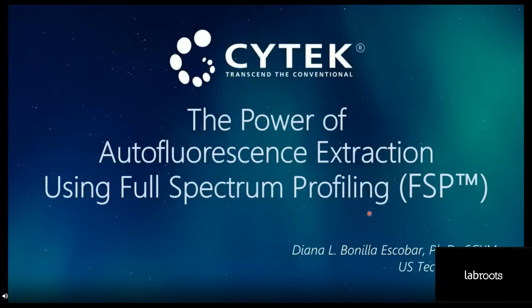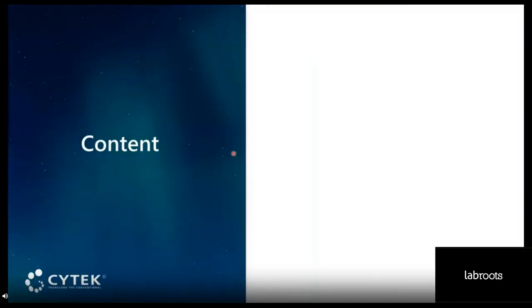Morning, everyone. Thank you for joining us today. My goal is to show you the power of using full spectrum profiling when you are understanding the autofluorescence in cells in suspension by using flow cytometry. This is the first part of a 3-lecture series focused on this topic of autofluorescence, which is that natural emission of light that we observe in cells.